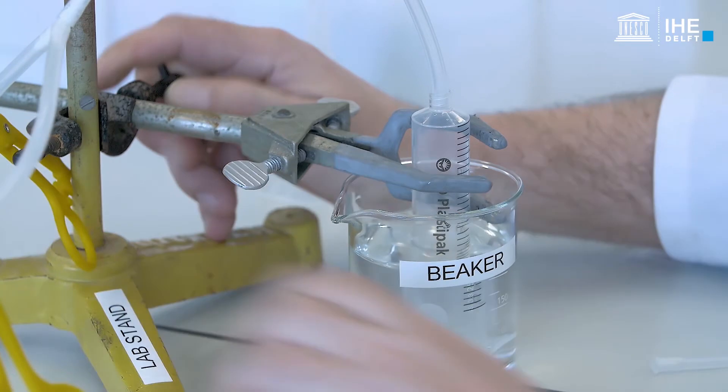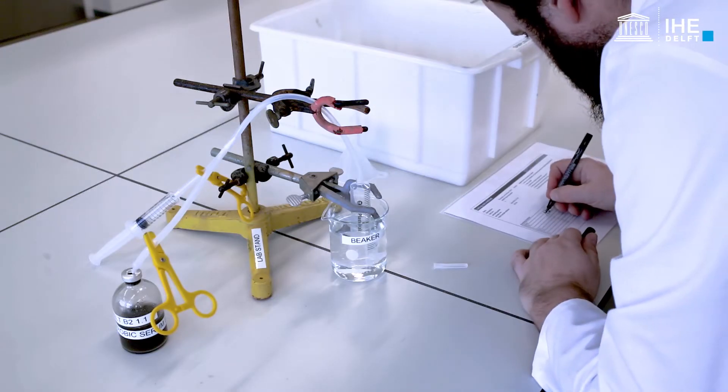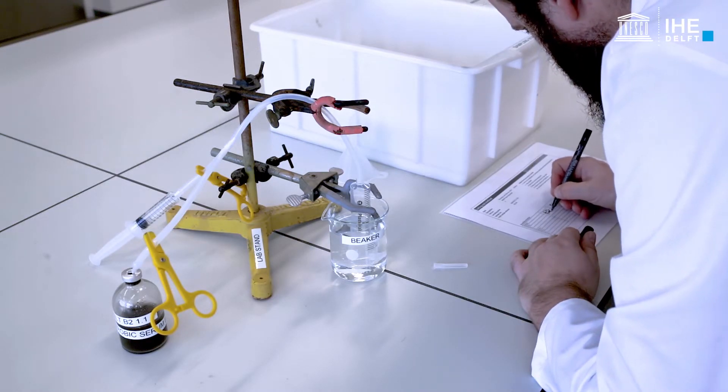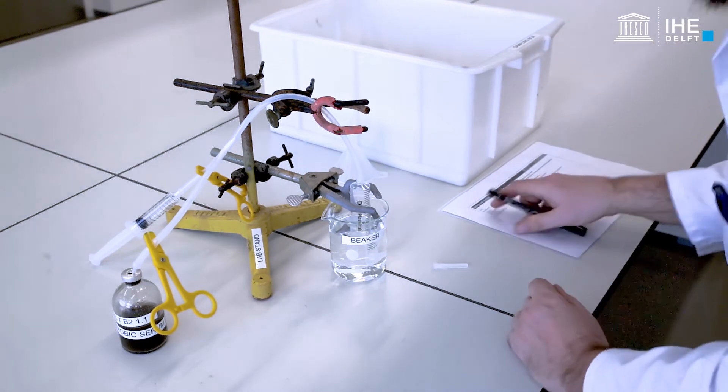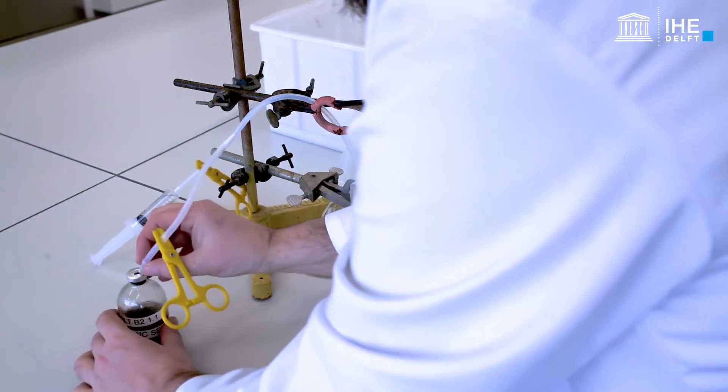Now, the water level in the syringe can be brought back to the water level in the beaker to cancel out the pressure of the water column and the new headspace volume in the syringe, volume one, can be registered.